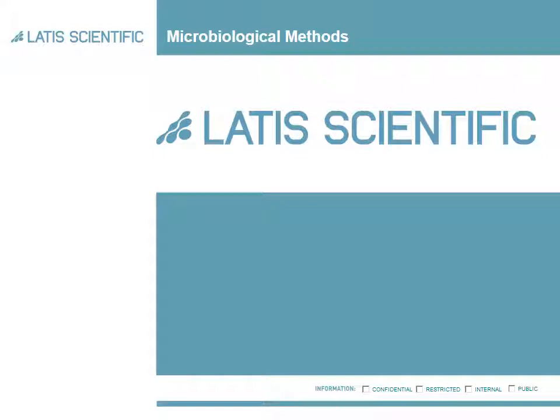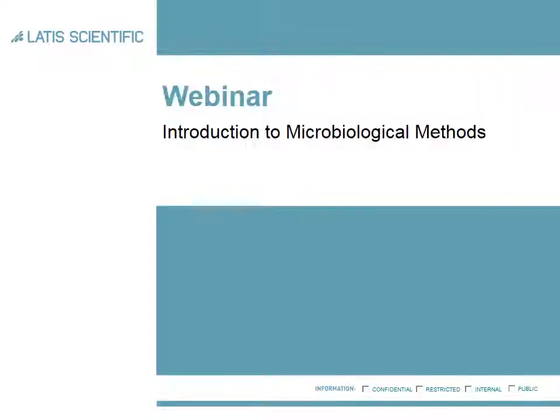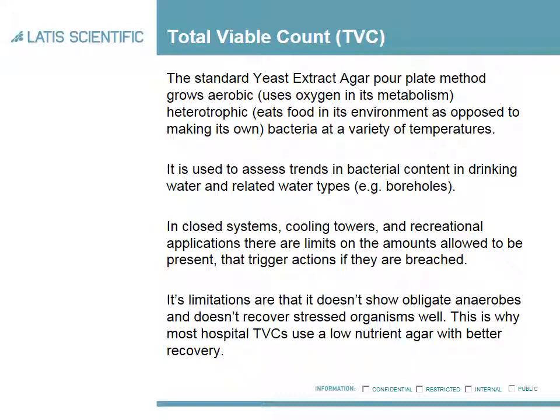My name is Richard Lawson, I'm the Technical Manager at Latis Scientific, and this webinar is covering an introduction to some of the microbiological methods we offer in our laboratory. The first and simplest microbiological method is the total viable count.